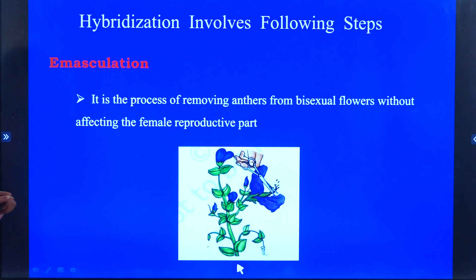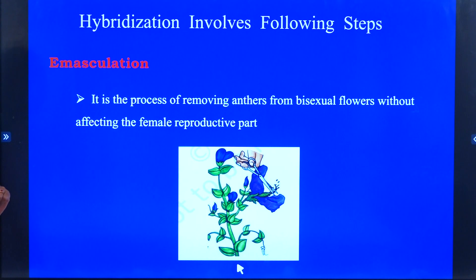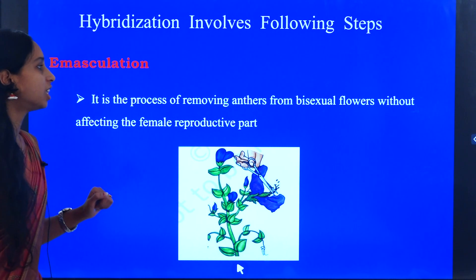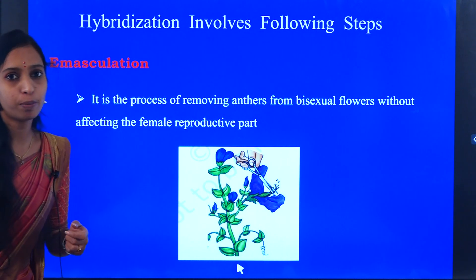The first step we are going to follow during hybridization is emasculation. What is meant by emasculation? The removal of anthers from a bisexual flower without affecting the female reproductive part.